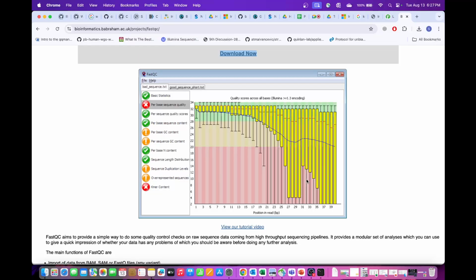So keep in mind when you are doing that, check for reviews and everything, how the Conda environment is working for that particular software. In most cases you'll have some limited capabilities for the Conda environment, but in certain other cases, it will work just fine. So it depends on software to software. It's better to have an idea about the limitations of those software before you download the Conda environment, right?